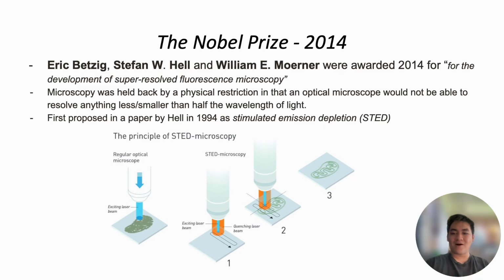All right, thank you, Mike, for all of that introduction, which will be really important when we start diving into specifics on how STED microscopy works. But first, let's look at the three awardees and understand the context of why there are three people awarded for this award, right? And so the three awardees were Betzig, Hell, and Moerner.